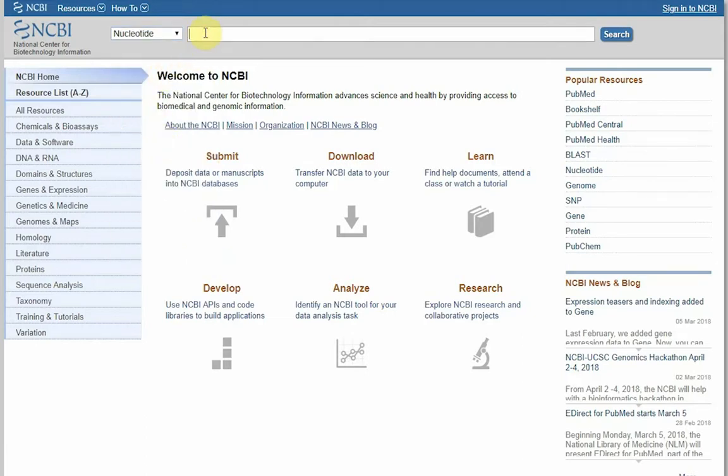and in the search box we are going to type E. coli HPCC. This is the name of the gene we are going to use today for this demonstration. Now we are going to click search.